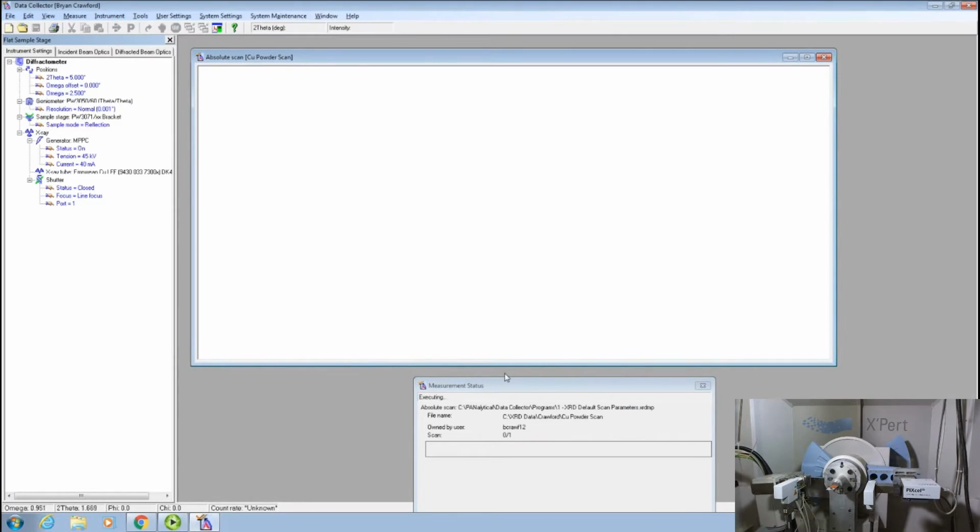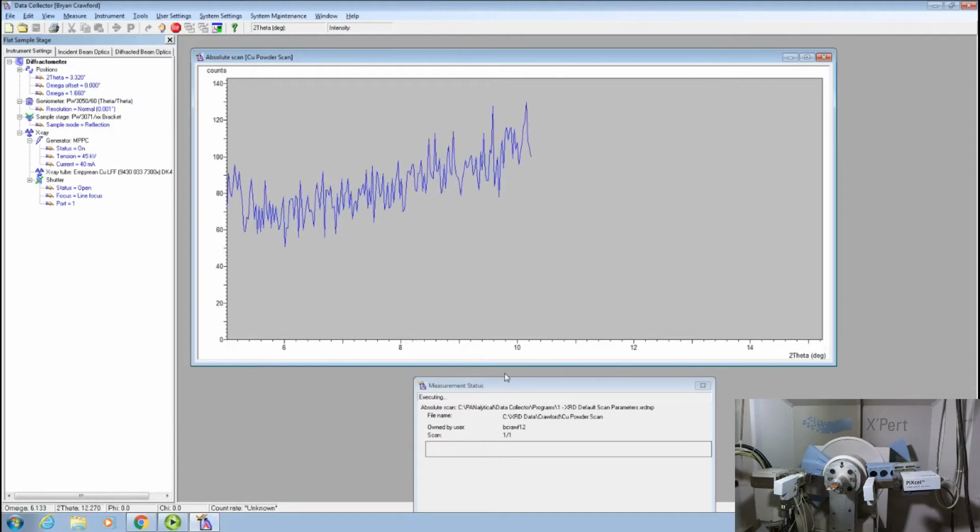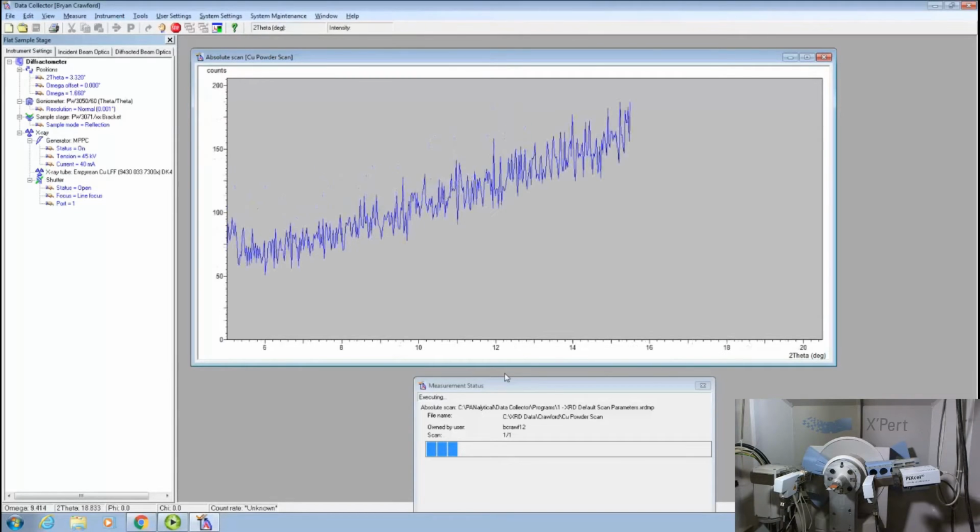It is starting its measurement. We just heard the interlocks engage for the doors. If the doors had been just slightly ajar, and sometimes those can be a little difficult to make sure that they are securely shut, then it would have thrown an error at that moment. The arms are gradually sweeping through the defined angle, and we're collecting the signal on the software screen.